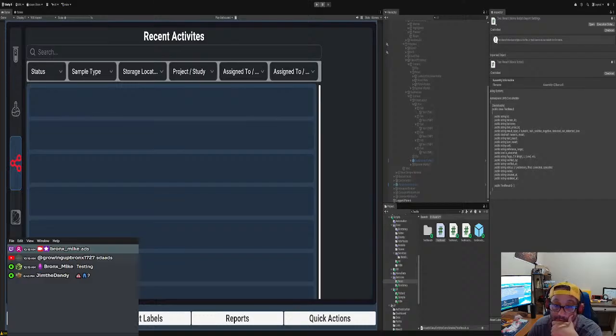So yeah, let me see. I asked the AI to fix it for us, but I wanted just for brevity. All right, so we have the test results. Okay, so now we got the test service, right? But we also gotta make sure the test service is following the method. It is, right? Okay, so let's do this first, right?